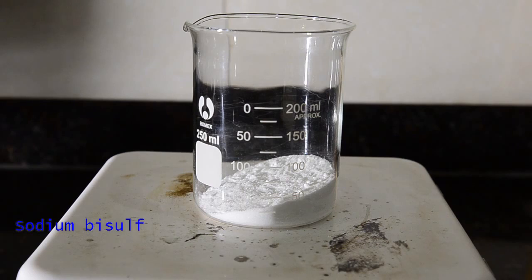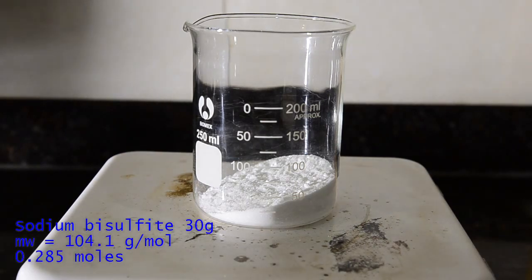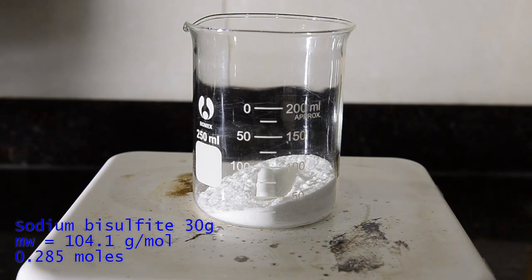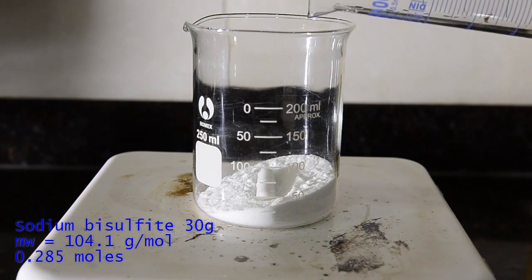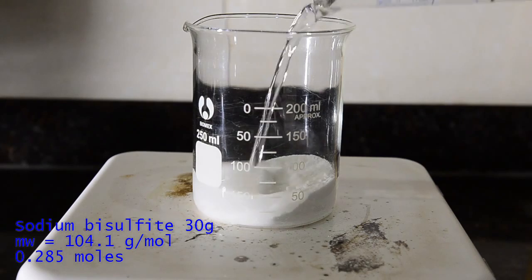First we need to create the bisulfite adduct of benzaldehyde, so weigh out 30 grams of sodium bisulfite. This is more than we need, but the adduct forms better if you use an excess quantity.